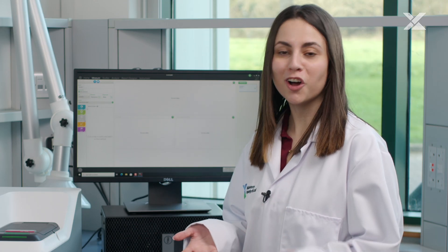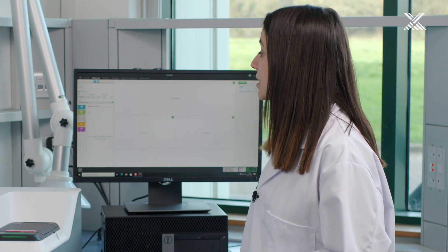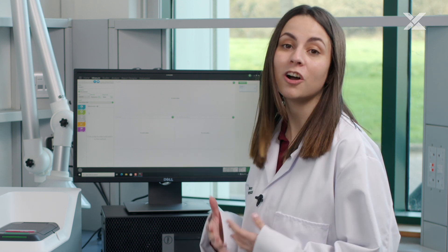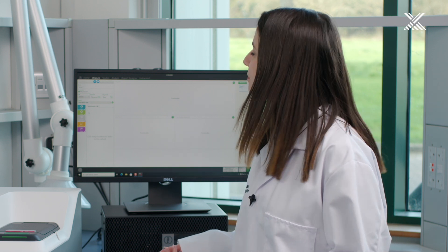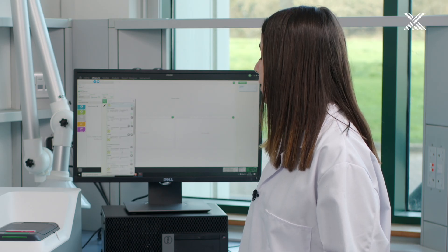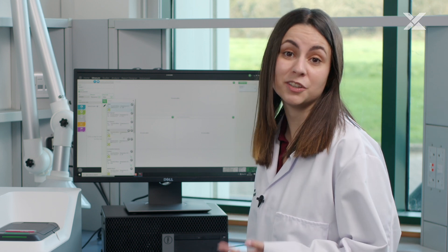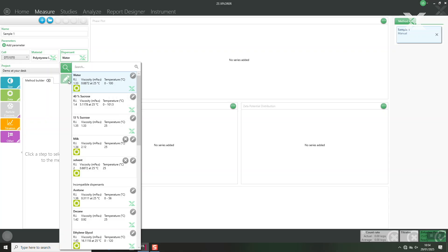As we can see the size measurement is still colored but now you have the zeta potential option colored as well. Then we need to select the correct material and dispersant. We have a library of different dispersants or material that you can use or you can add your own if you select the edit button.